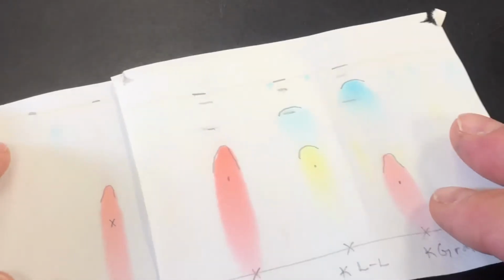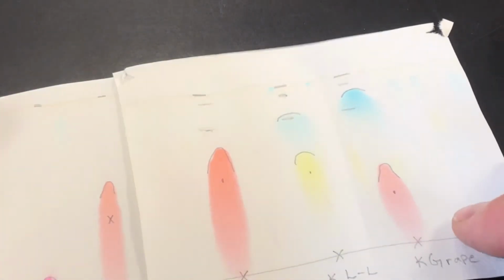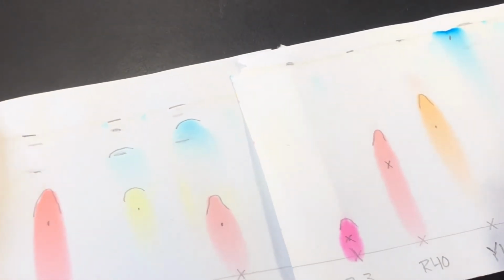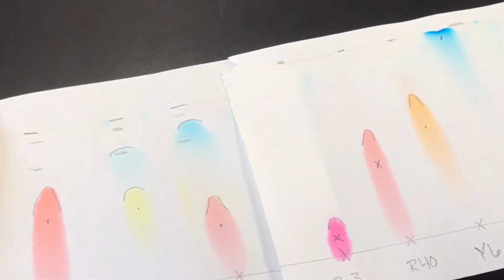So for our Kool-Aid and strawberry, we're going to see these match up. This one definitely looks very similar. In our grape, well, purple for grape, blue and red. So is it going to be this one or this one?